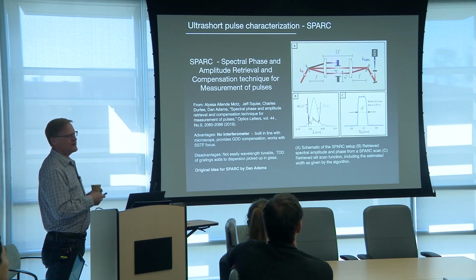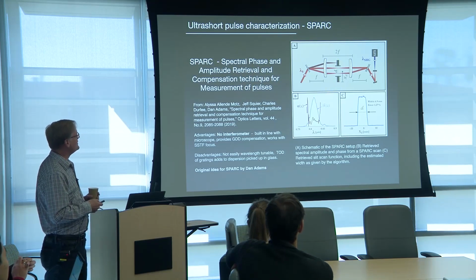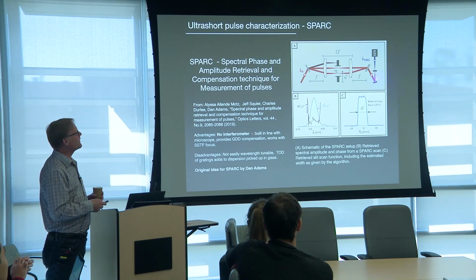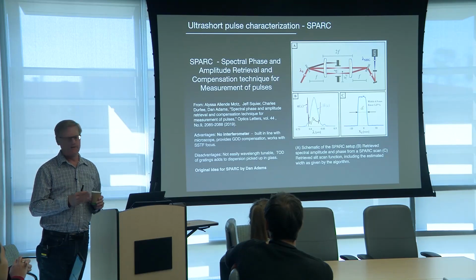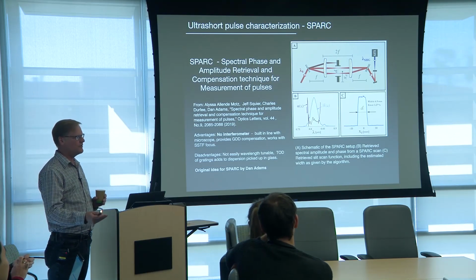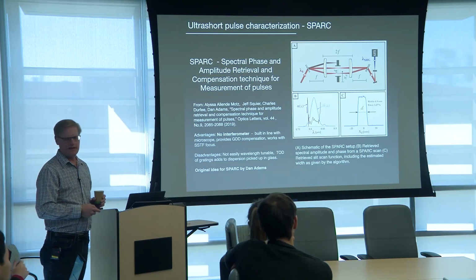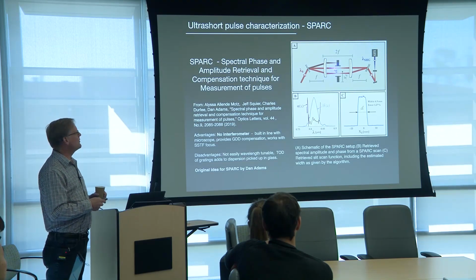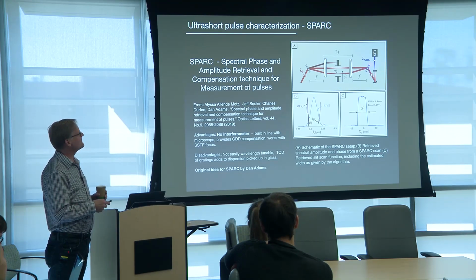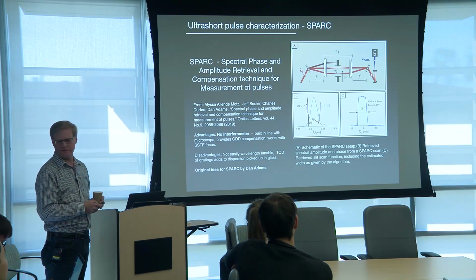But I've created this Fourier plane over here, and what is nice, I'll show you in a minute, is that you use this grating and alter its position to compensate for the group delay dispersion in your microscope or your laser. So you can alter that position, and that gives you second order dispersion compensation. So this is your dispersion compensation system. But what you can do, as we show here, is go into a doubling crystal and spectrally resolve that light. I'll show you how we embed it into the microscope as we go along.